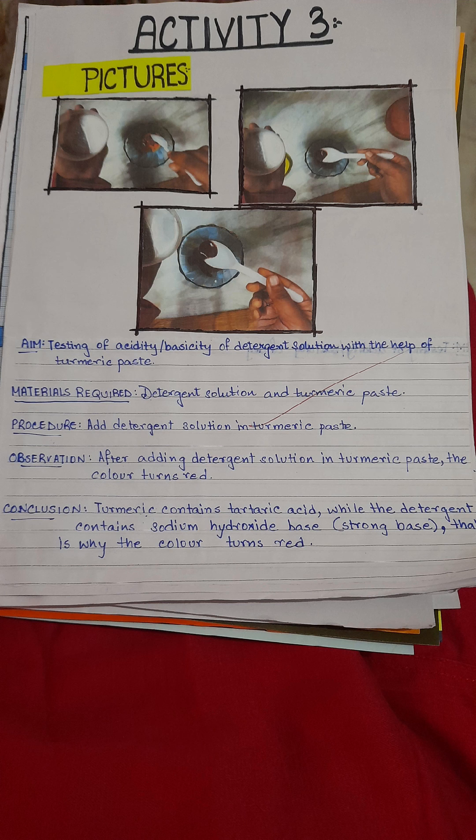This is activity three. We will test detergent powder with turmeric paste. Here, as detergent is a base, we could see there is a color change.